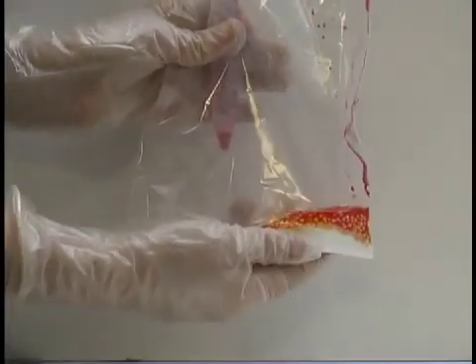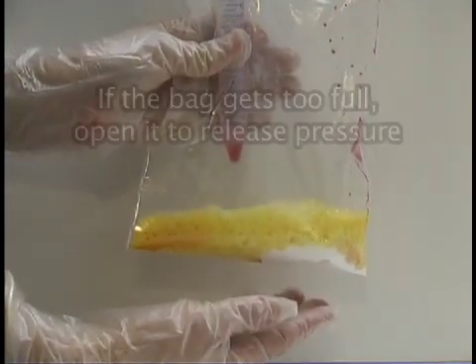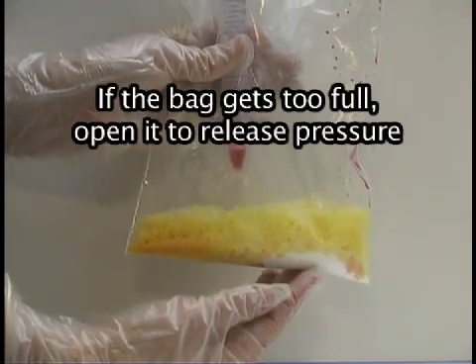You will notice that the mixture turns a yellow color, foams, and starts fizzing and producing gas. The contents of the bag will also get hot, so be careful.